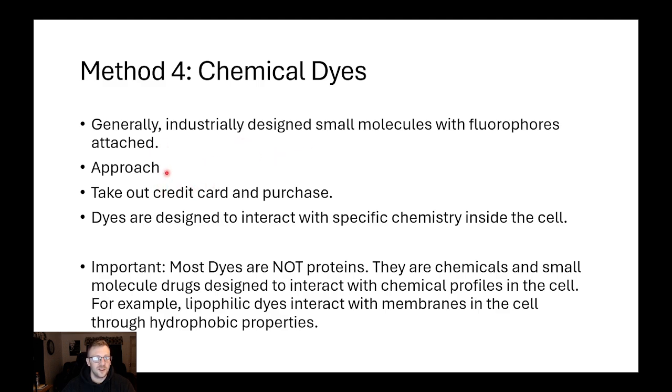So the purification approach for this one is you're going to pull out your credit card and you're going to purchase it, right? This is not something you're going to synthesize in your own lab to be able to be used. And then dyes are designed to interact with specific chemistry inside the cell. So they're chemistry motifs, but not specific proteins. I hope that's clear on the differences between like dyes and the protein levels. One is against a chemistry environment, one is against a protein environment.